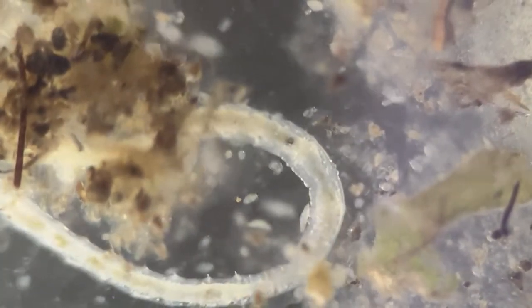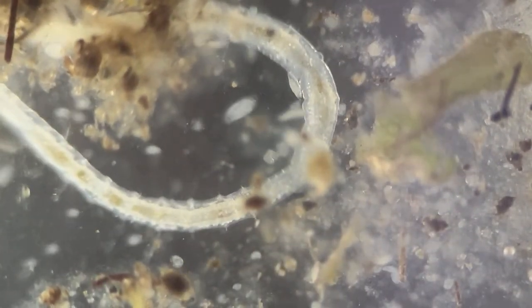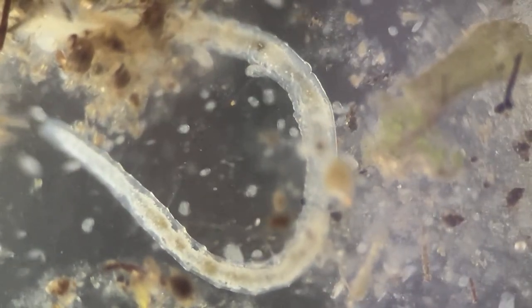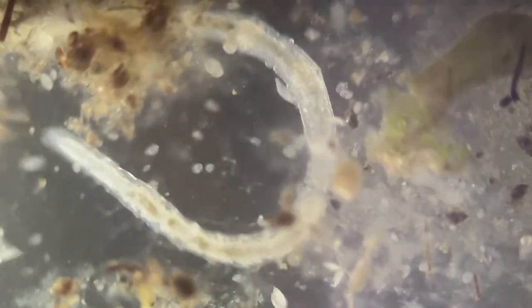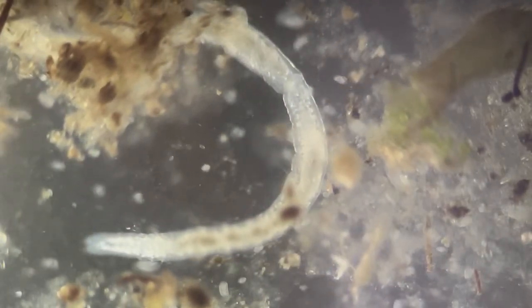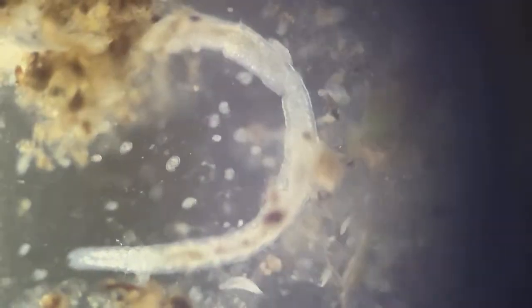I can't tell you how excited I am observing the architecture of this little microscopic worm, which is gigantic in relation to its other folks in the sample. But then, okay, let me again tweak the camera a bit, because probably the alignment is slightly off the track.